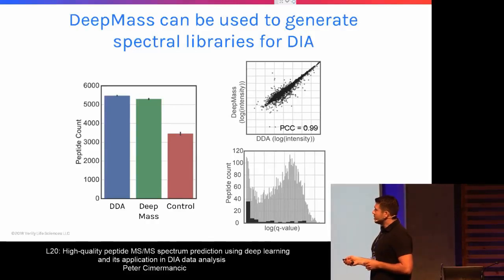There are a few that we missed. There were about 80 of those out of 5,000-something that we missed. And those, as you can see here, had really high Q values to begin with, meaning that they were not that significant to begin with.